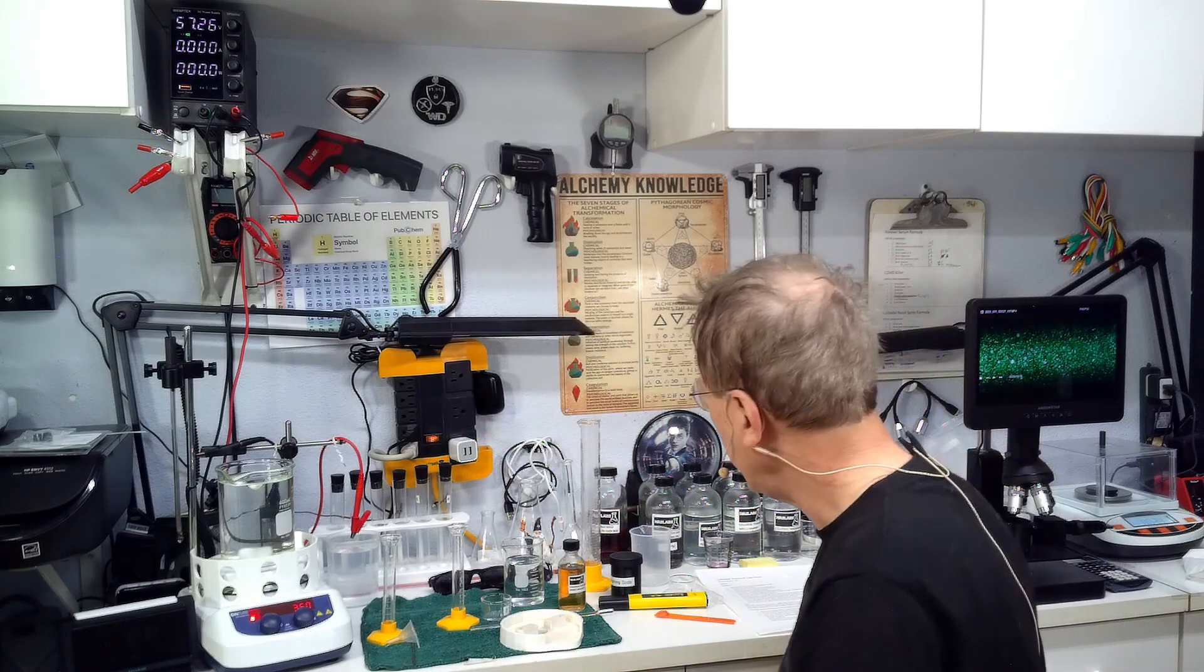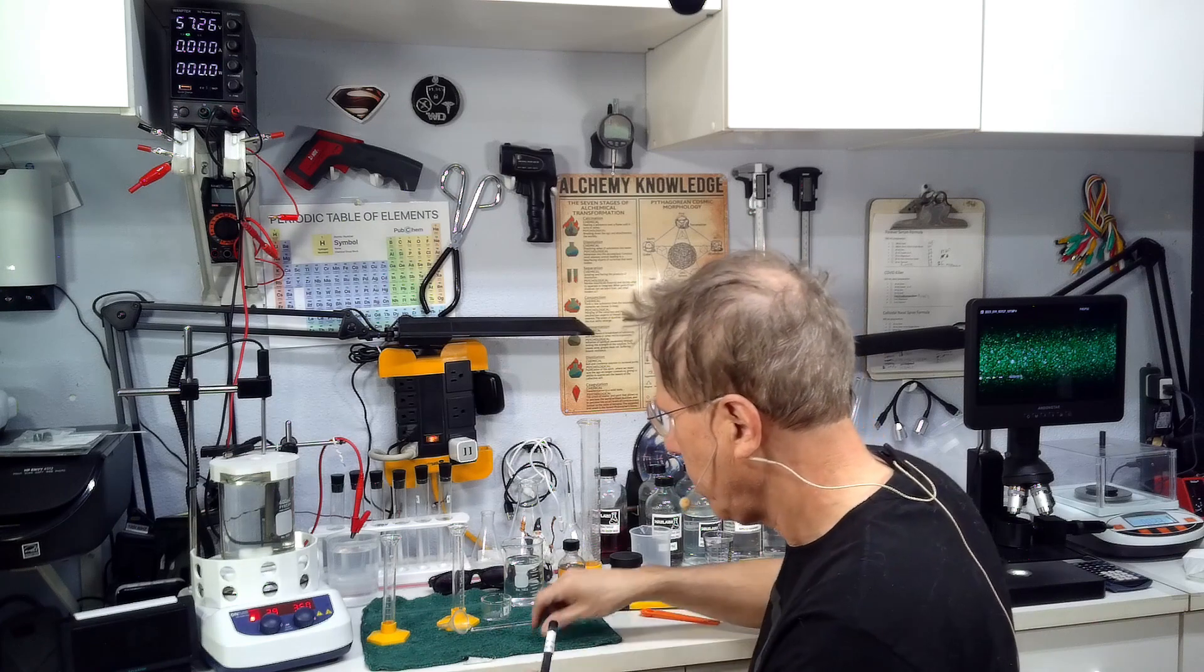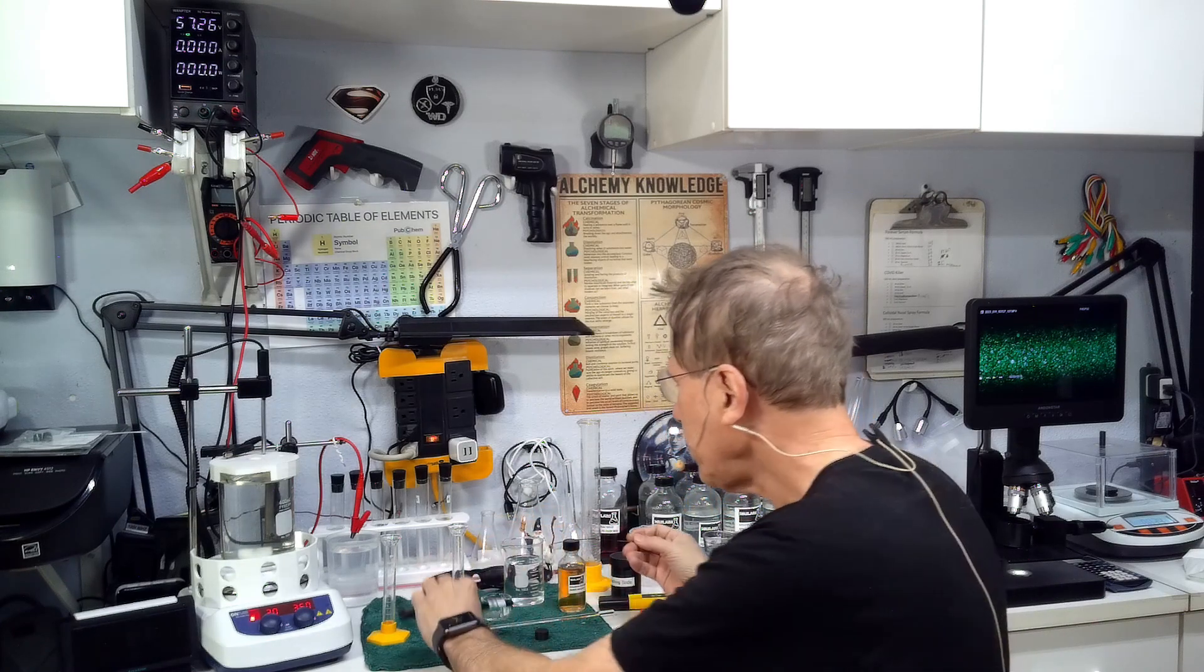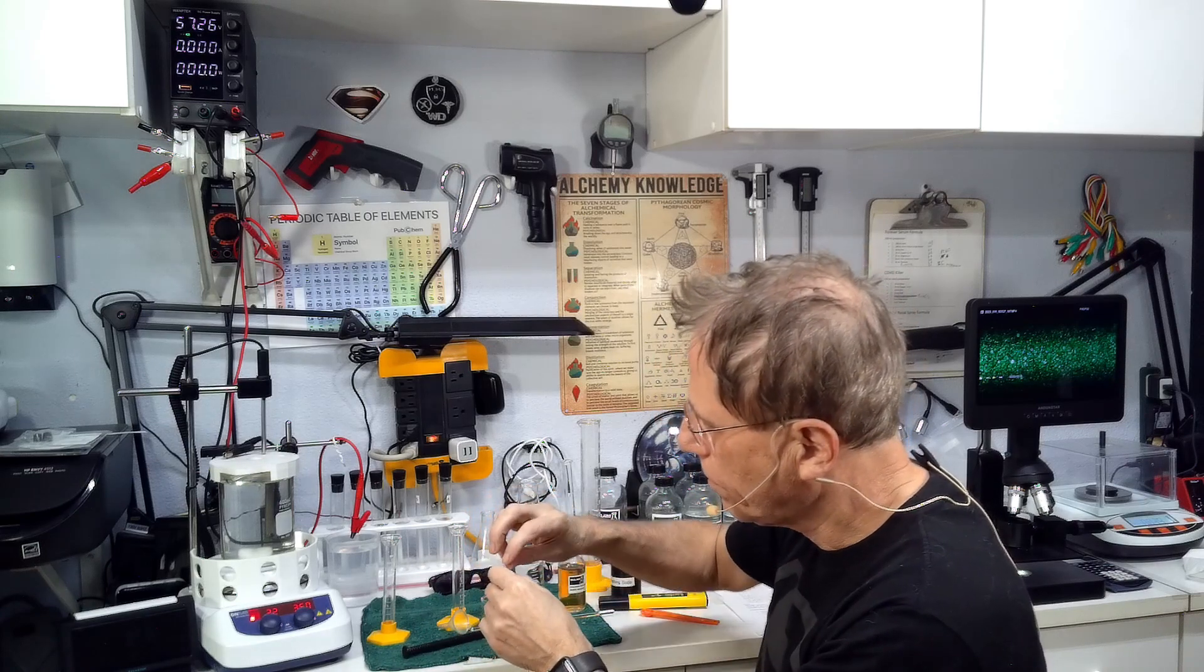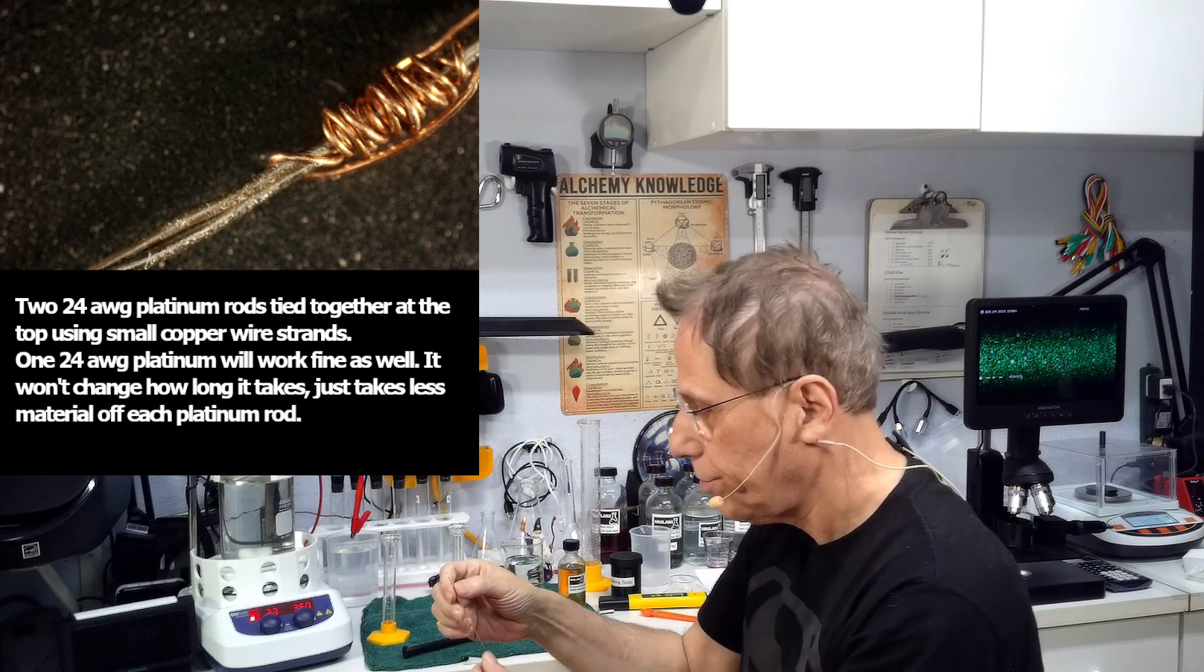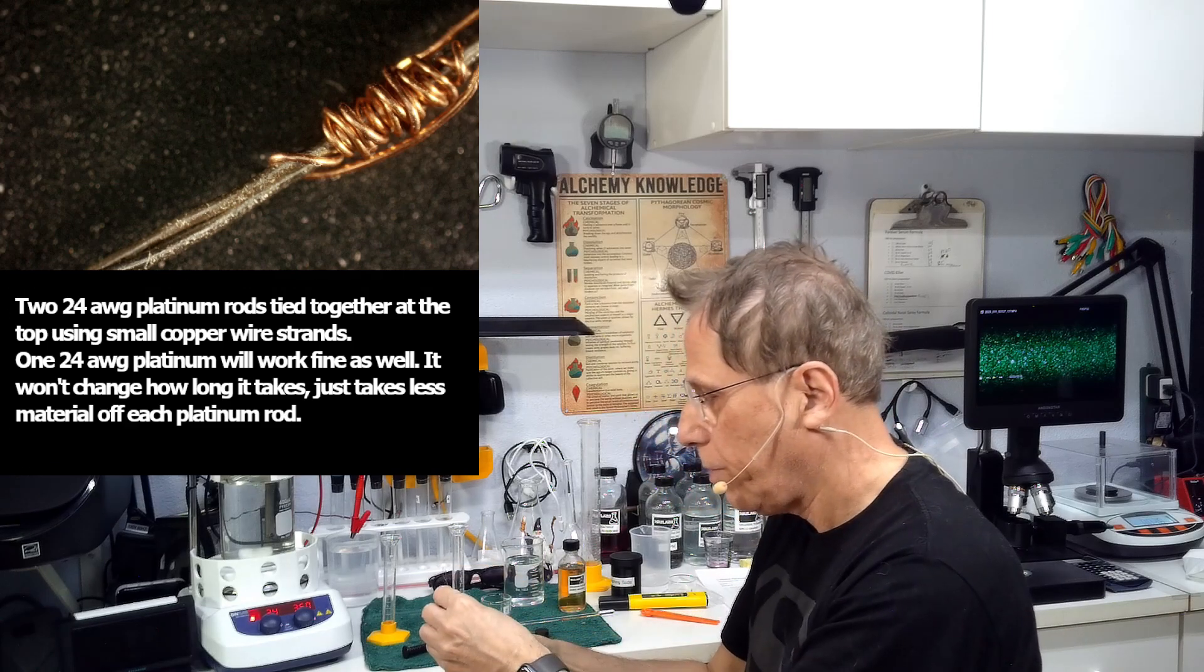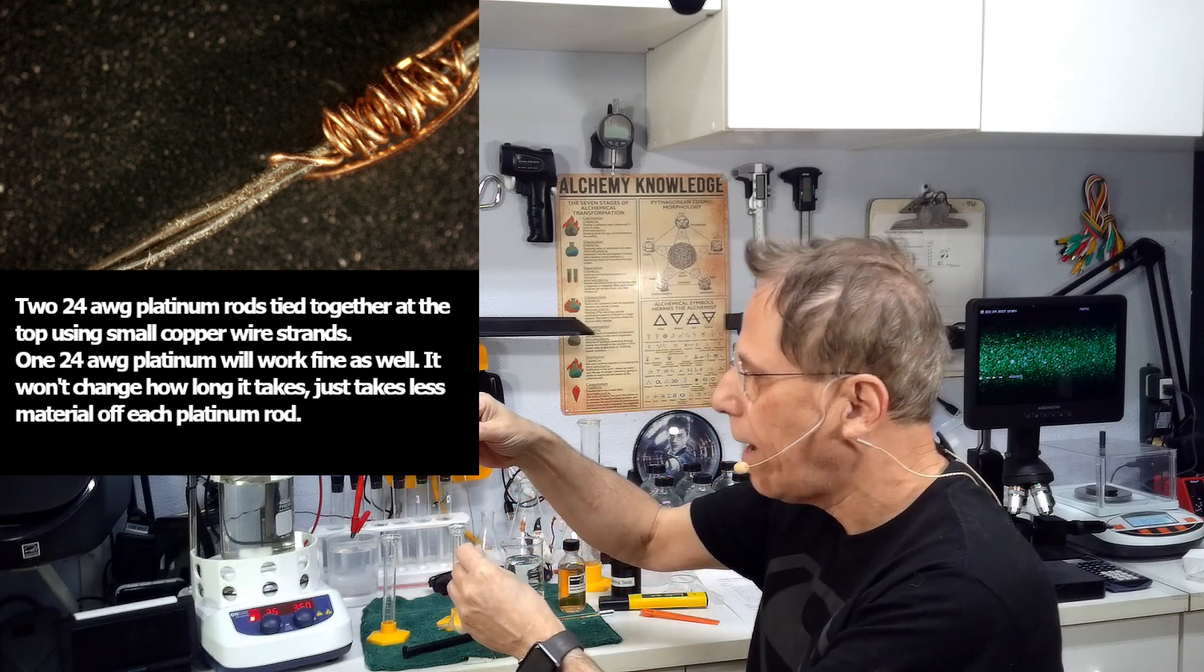We're going to let like 100 milliliters of that boil away, and then when it starts dropping below 500 milliliters, you're going to start putting this in to keep the pH high and to keep the fluid up. This is my platinum rod. I'm using two platinum rods.